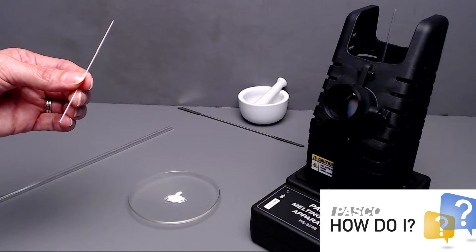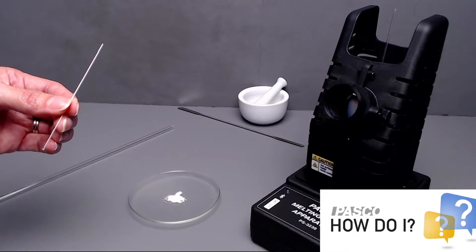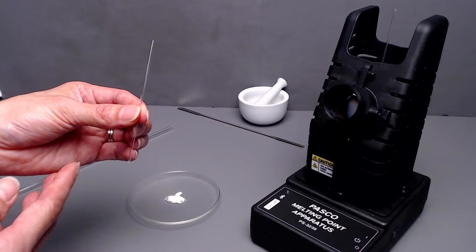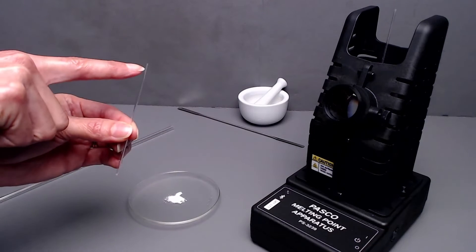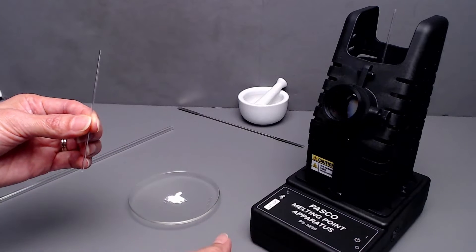How do I prepare a capillary tube to study melting point with the melting point apparatus? This is a melting point capillary tube with an open end and a closed end. It comes with the melting point apparatus.